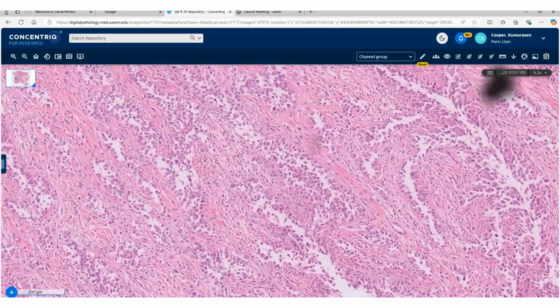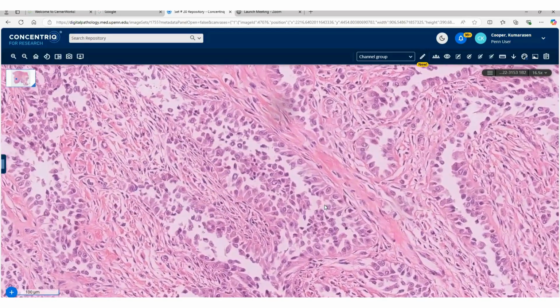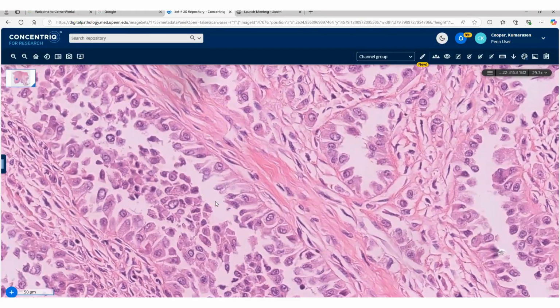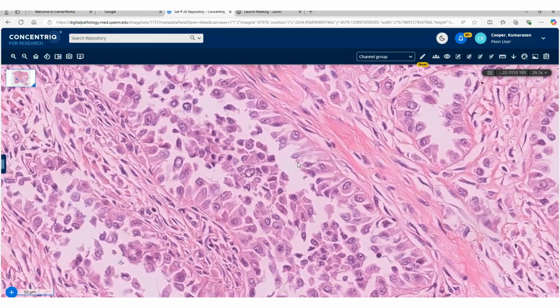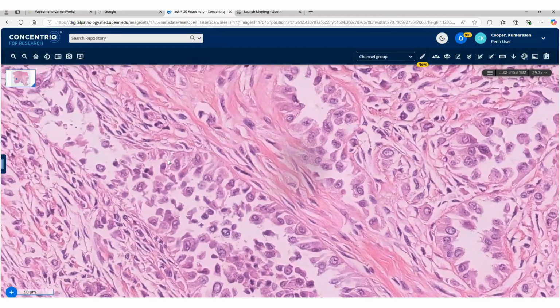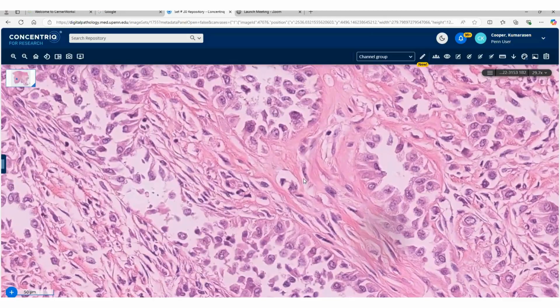You can see these trabecular cords and bars of cells, and I'm going to show you the collagen in between these areas. Go down on higher power. These are not glandular structures. These are artifactually separated. So just to get that aspect out, that you're not thinking it's epithelial, just to help you along with that component. They're just a trabecular architectural arrangement of these tumor cells.